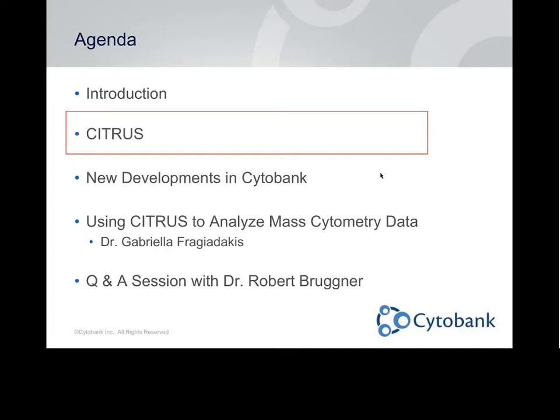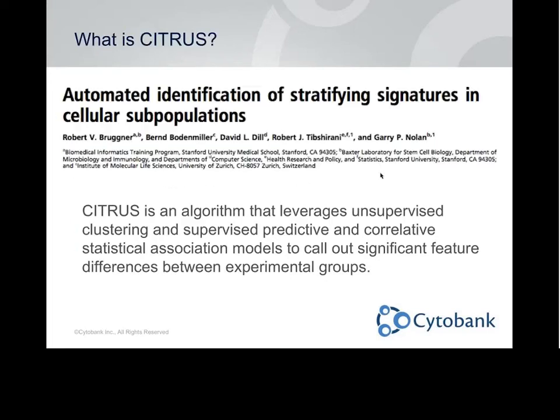Here's why we're here today. Citrus. What is Citrus? This is the title and the authors of the paper in question. It's a pretty excellent algorithm at analyzing groups of data.